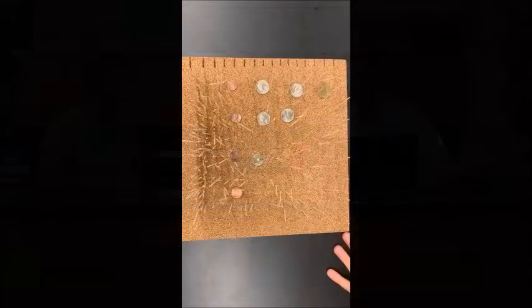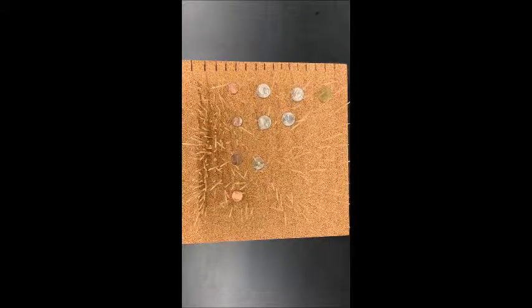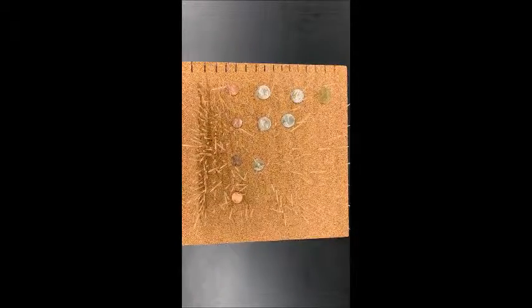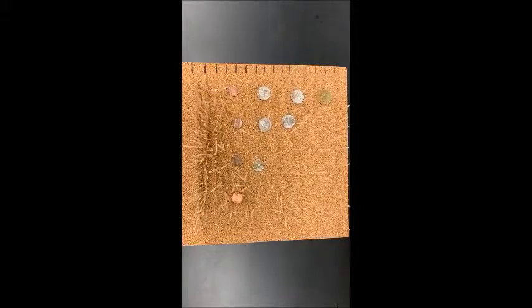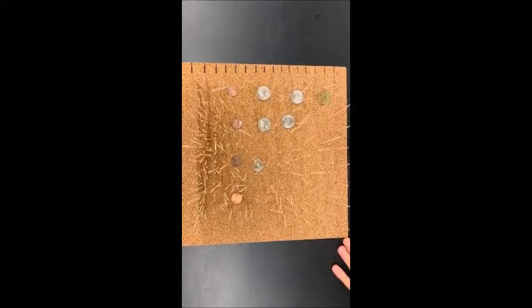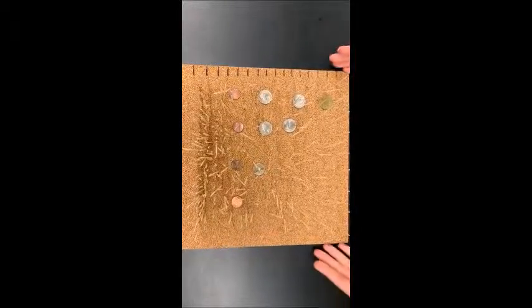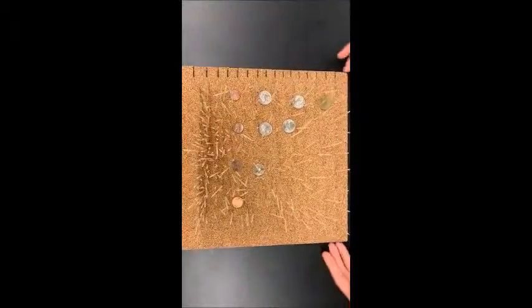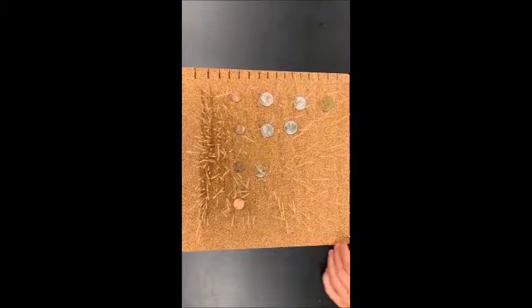If you want, look at this model that I have. The model is used to determine SDS-PAGE. It shows SDS-PAGE, and it's used to determine which fraction contains the purified protein and understand the progress of purification from one fraction to the other. As you can see, imagine that the wood part is a chamber, while the toothpicks represent the gel containing the space for the protein to go through.